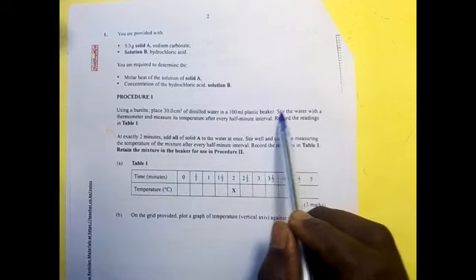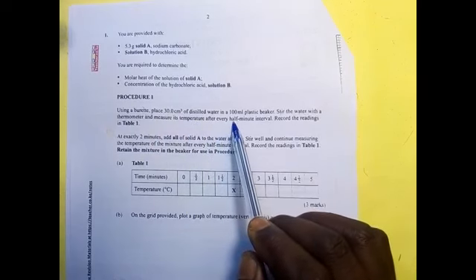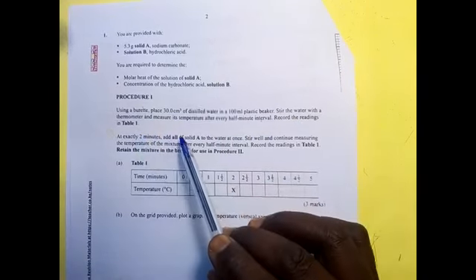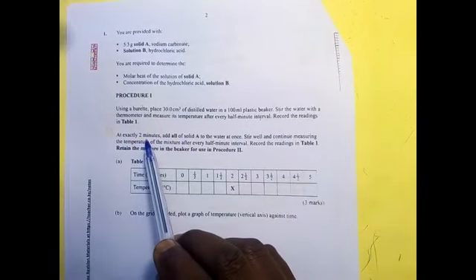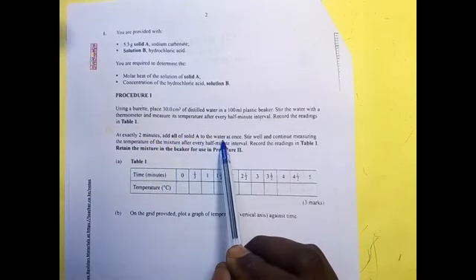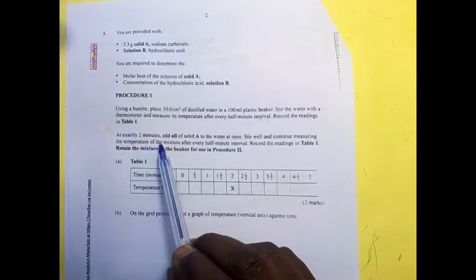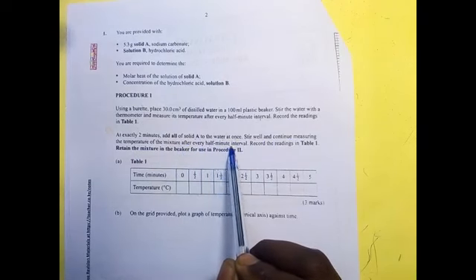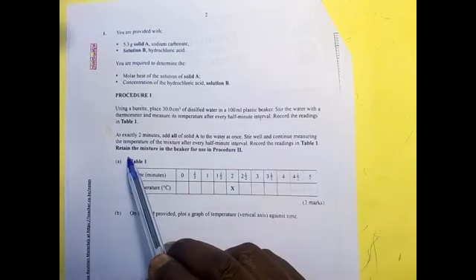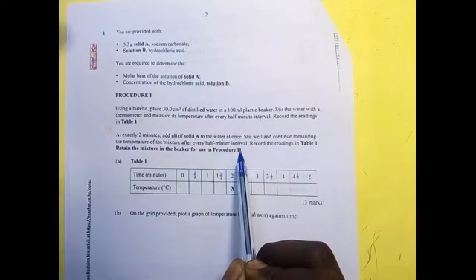Stir the water with a thermometer and measure its temperature after every half a minute interval. Record the readings in table 1. At exactly 2 minutes, add all of solid A to the water at once. Stir well and continue measuring the temperature of the mixture after every half a minute interval. Record the readings in table 1. Retain the mixture in the beaker for use in procedure 2.